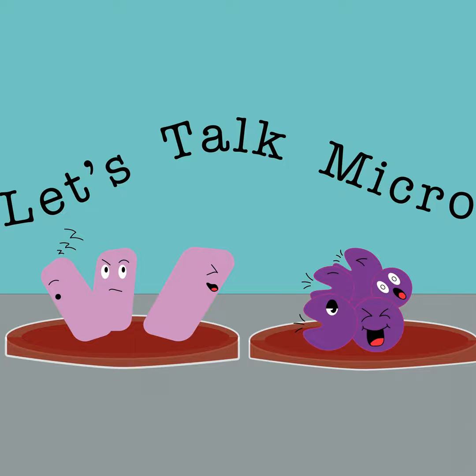And with the microscopy, the pluses were being forced to learn how to use the microscope without a lot of outside help, and being able to do the same or very similar kinds of things at home as they did in the lab. So I didn't feel that they lost anything that way. I think the downside was that sometimes students got frustrated and sometimes it took them a little bit longer than I would have liked to catch on to it. And without me being there to actually help them, it was a little difficult.